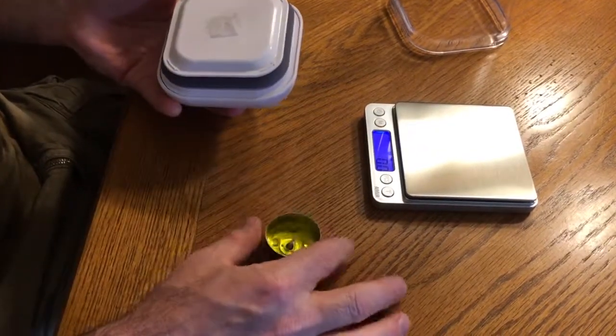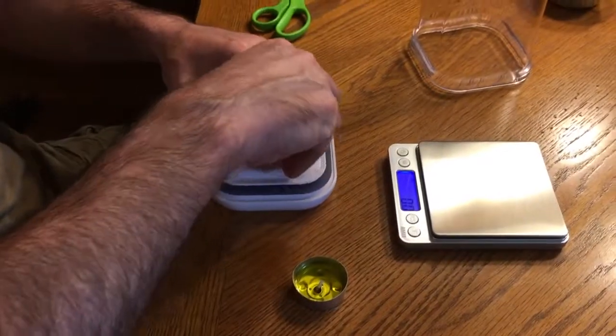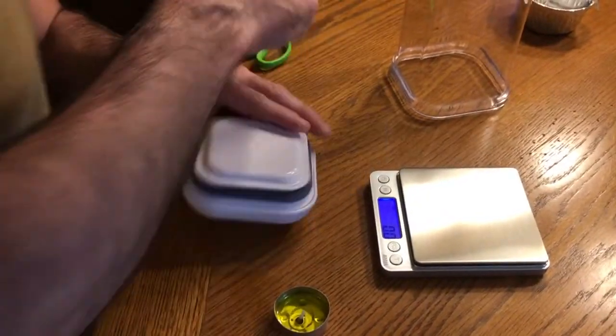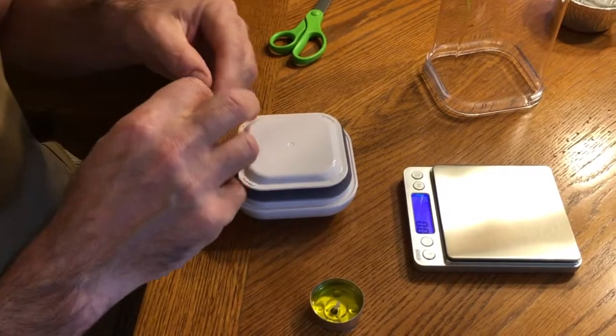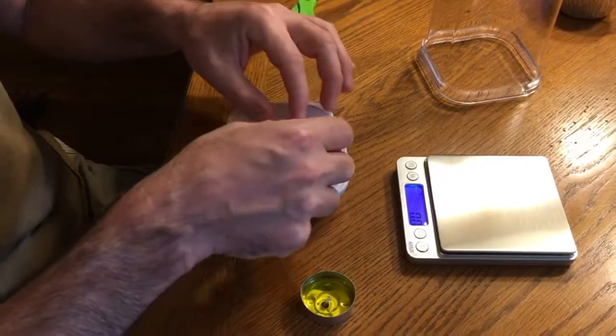I think that tape is not that good right now. Let's get a little bit stronger piece of tape. Got some packing tape here — I'll turn it on its back to make a roll.